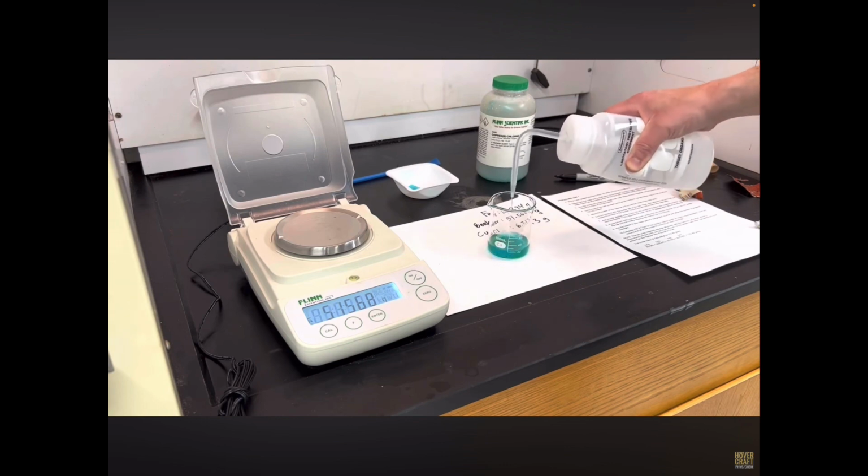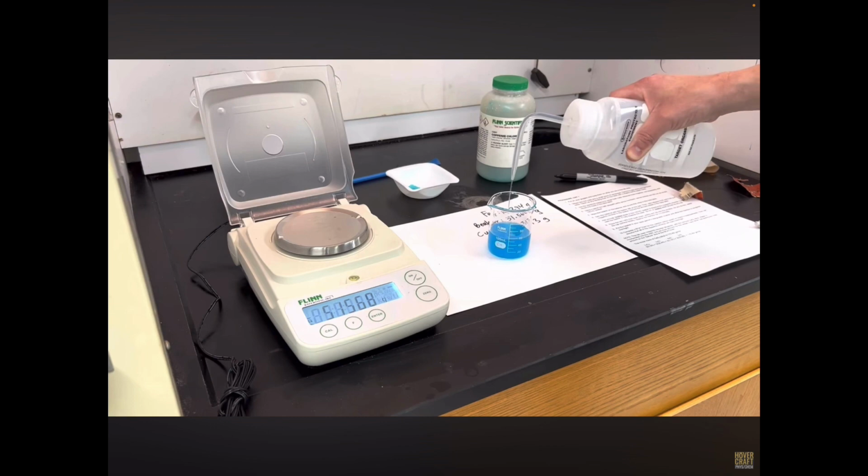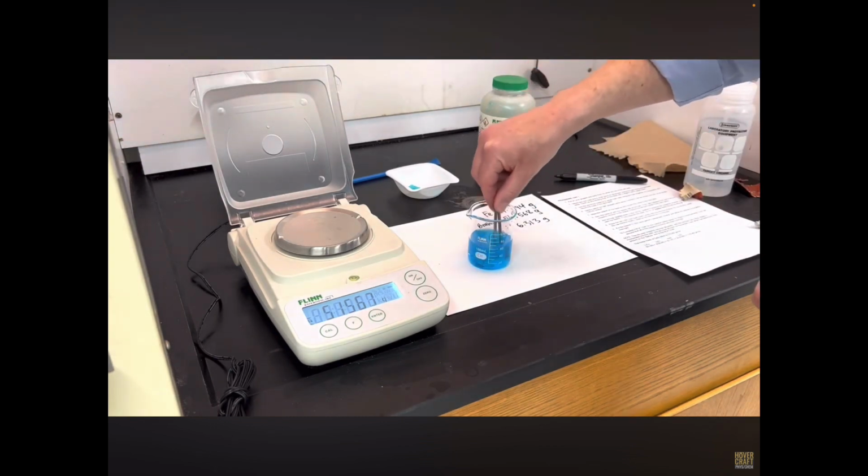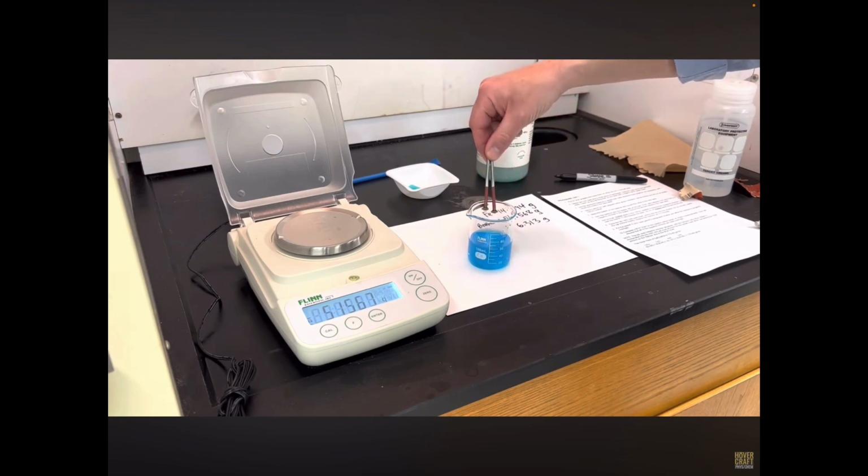So I'm trying to dissolve the copper 2 chloride. And you get a nice bright blue solution. Then to make the reaction go, it says place the nails side up and swirl a little bit. And you can already see that some copper has formed.